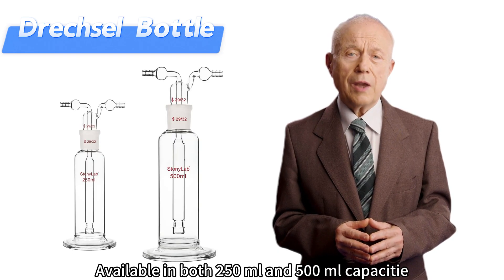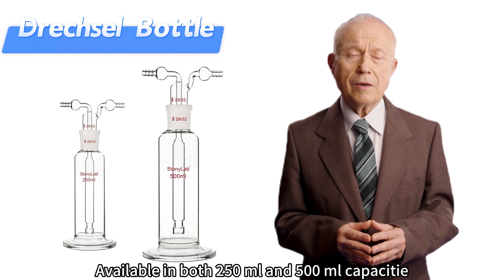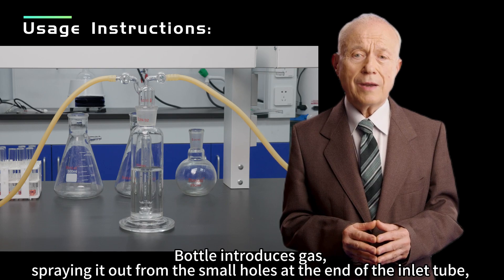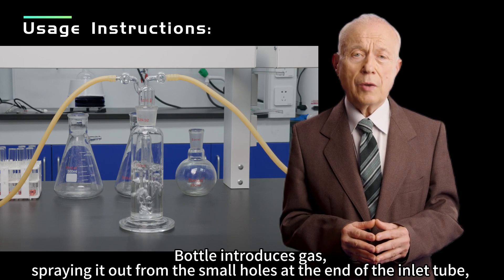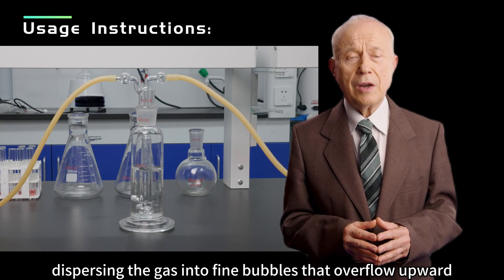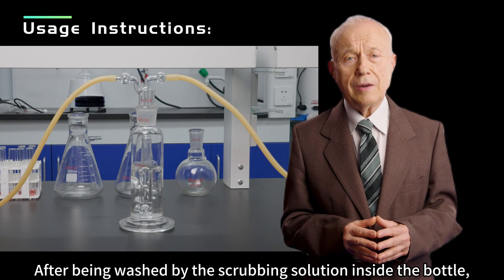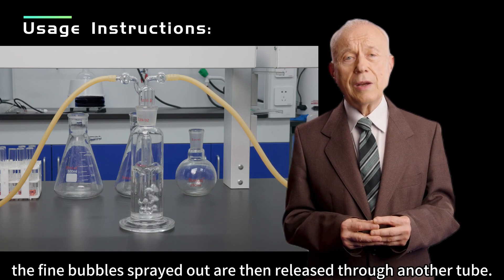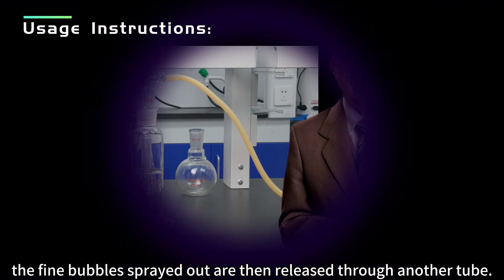Available in both 250 mL and 500 mL capacities, the bottle introduces gas, spraying it out from the small holes at the end of the inlet tube, dispersing the gas into fine bubbles that overflow upward. After being washed by the scrubbing solution inside the bottle, the fine bubbles sprayed out are then released through another tube.